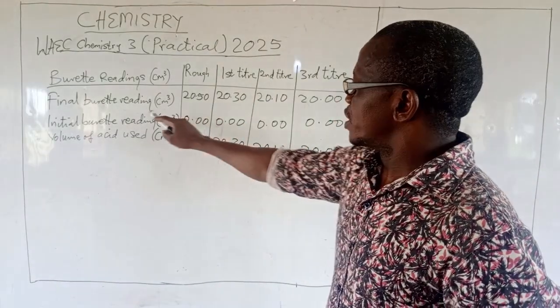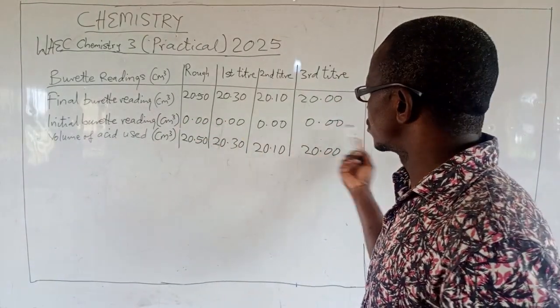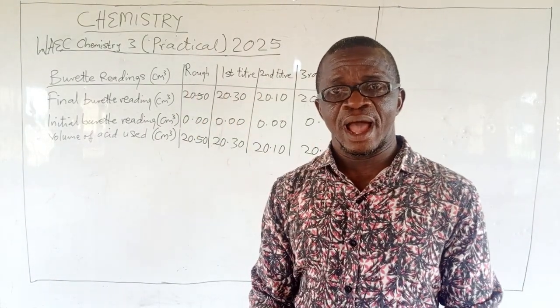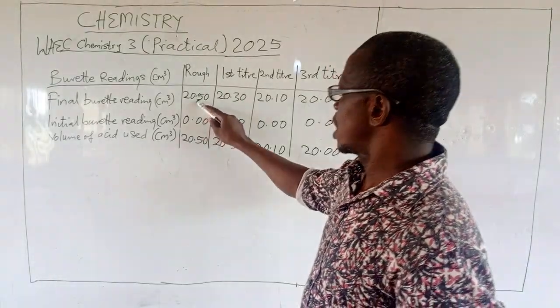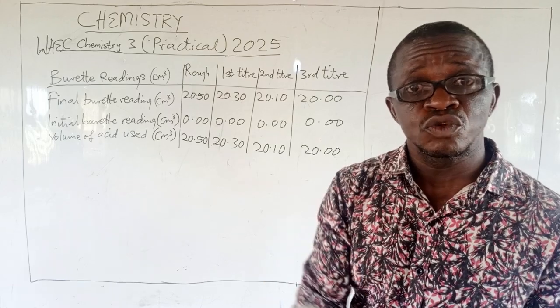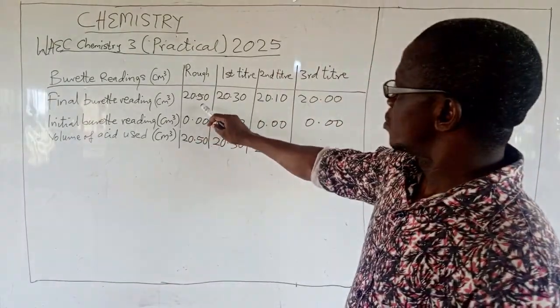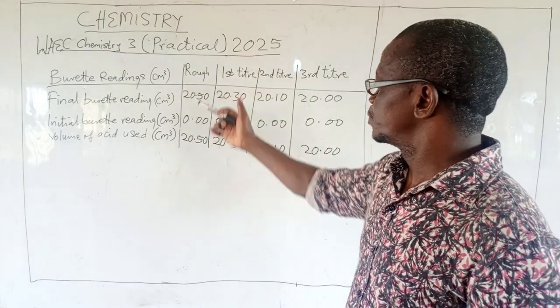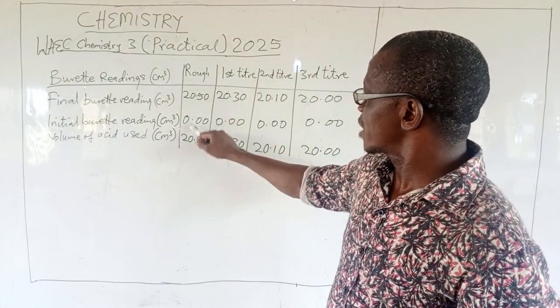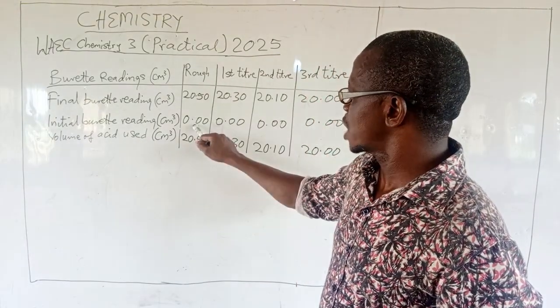My rough work, the initial volume was 0. I started with 0. Then final volume, when I observed the color change, I stopped. And the value was on the burette. You know that burette is supposed to be holding your acid, while pipette is supposed to be holding your base. So you take the reading from your burette, and this is what I have. Subtract this from this, get your volume of acid. So this is initial, this is final.